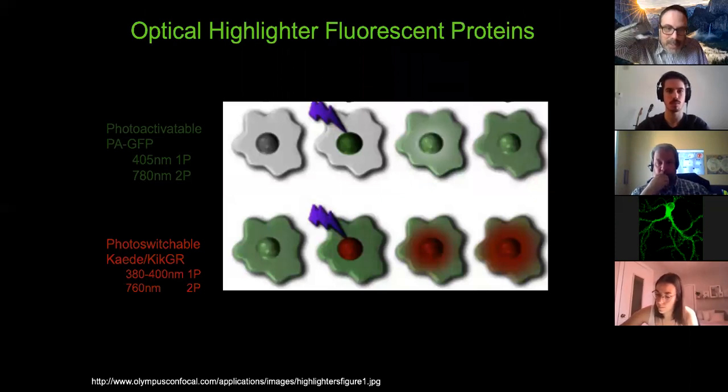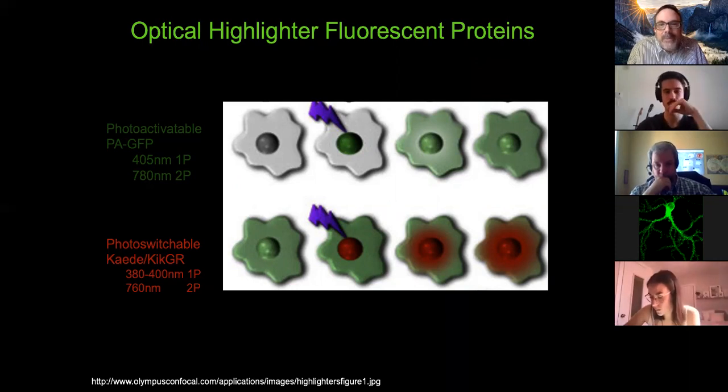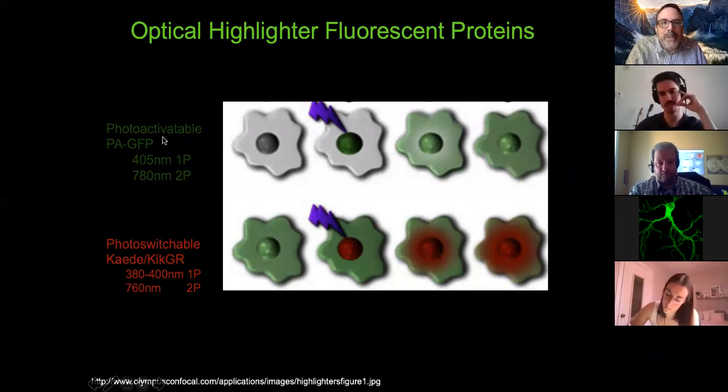The other approach that has been a clever way to get single cells out of bulk electroporation or bulk genetic expression is to take advantage of optical highlighter proteins, right? And so you've probably all seen this kind of approach. There are many different optical highlighters. The ones that we've looked at are photoactivatable GFP. This is still a very, very useful and very, very efficient highlighter protein.